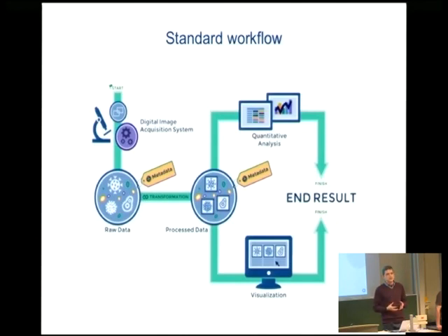Each manufacturer of a microscope tries to log in their users into their specific file format, their specific desktop client. So sharing that image between scientists in a single lab or between lab groups can be very, very hard and frustrating, especially if you work in a facility where computational time is being bought by the hour. Then the closed source format is reduced in resolution for presentation and rendering in the client, and also the access is local, so not many pieces of software make use of the client-server paradigm that has been in use for many years.